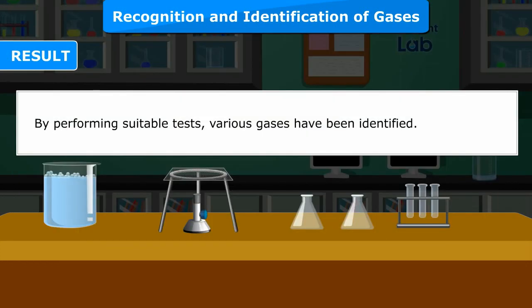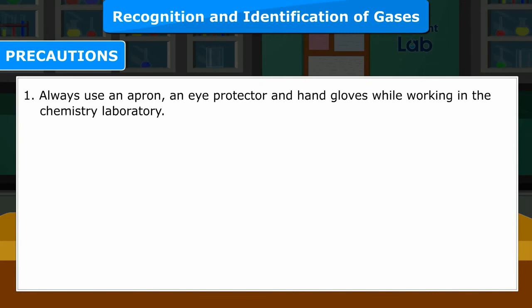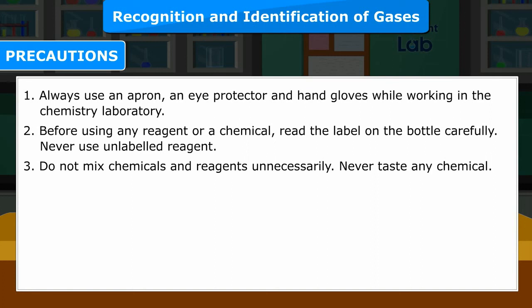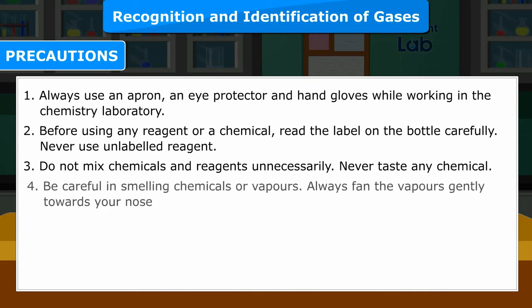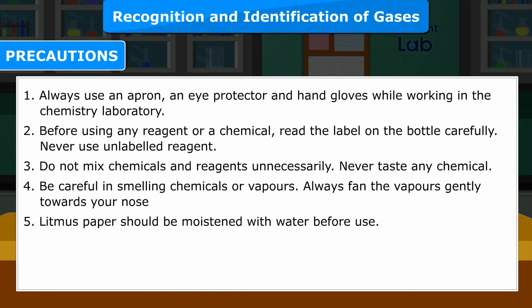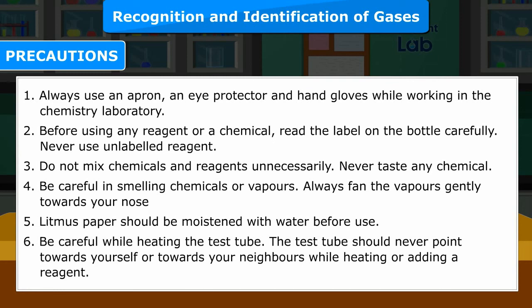Result: By performing suitable tests, various gases have been identified. Precautions: 1. Always use an apron, eye protector, and hand gloves in the chemistry laboratory. 2. Before using any reagent, read the label carefully — never use unlabeled reagents. 3. Do not mix chemicals unnecessarily; never taste any chemical. 4. Be careful smelling chemicals — always fan vapors gently towards your nose. 5. Litmus paper should be moistened with water before use. 6. Never point a test tube towards yourself or others while heating.